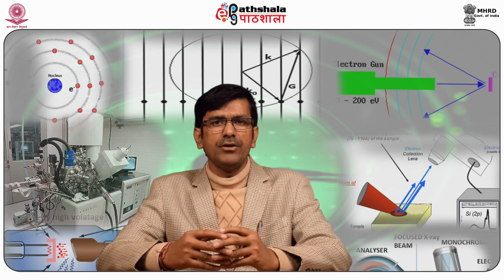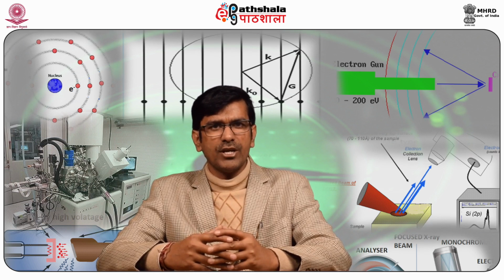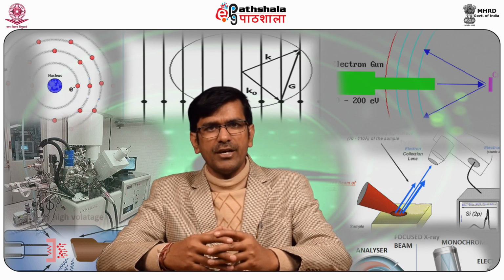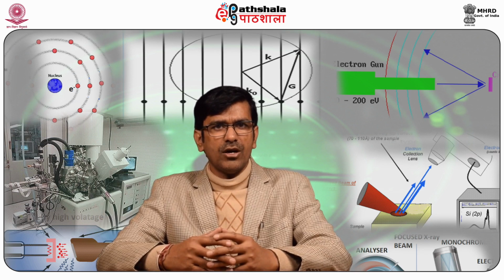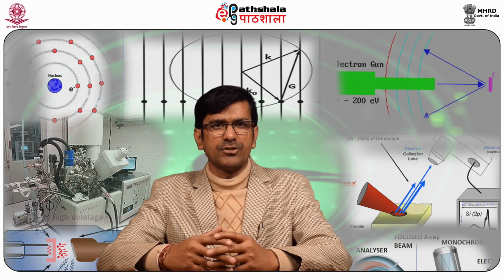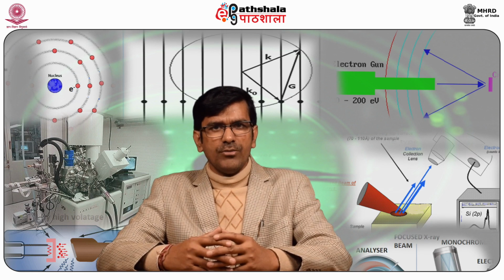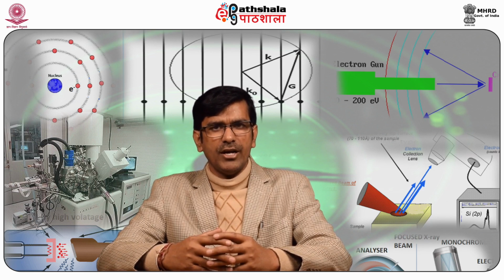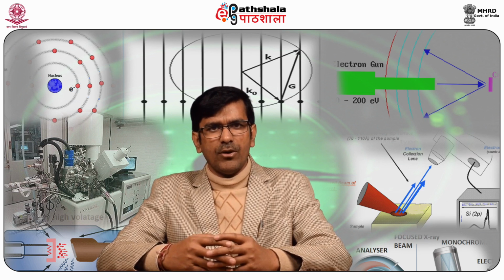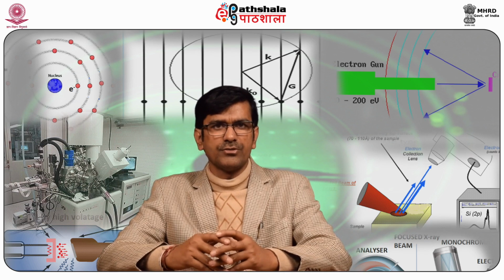Monochromators will be coupled to higher energy X-ray sources, that is about 3 to 10 kilo electron volt, so that studies can be made at lower surface depths without undue loss in resolution. Synchrotron radiation should come into its own, and studies will be possible over a large continuous range of photon energy, that is about 10 to 10,000 electron volt with good resolution.